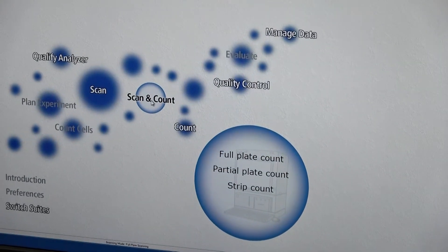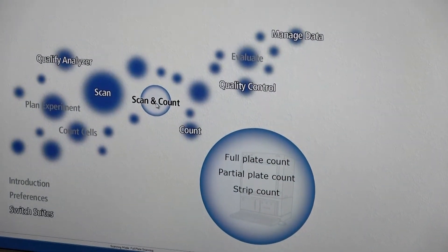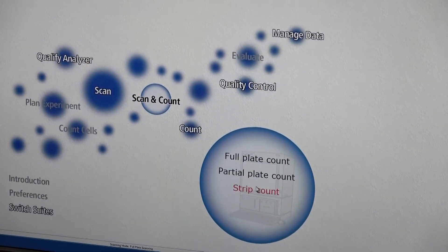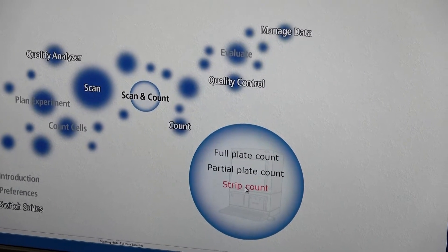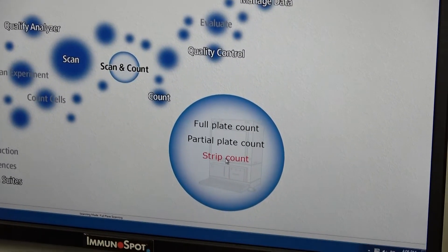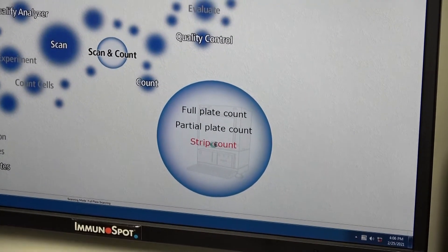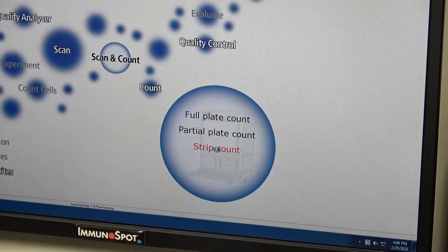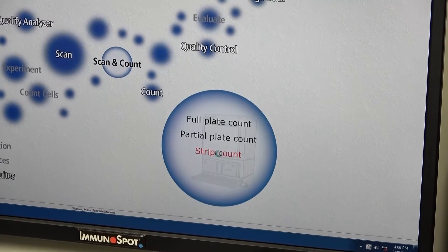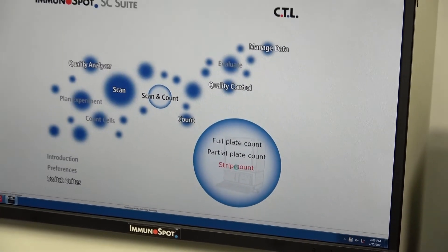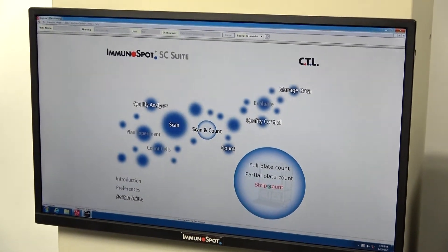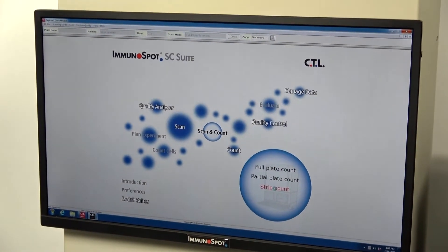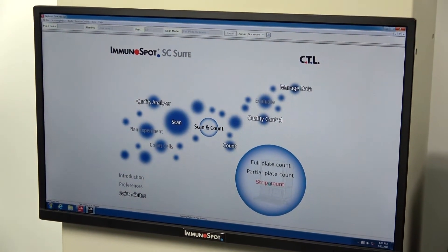The scan count, we tell what part we want to scan. Let's say we want to do a strip count, which now it's going to do everything in row 12, for example. It loads the software.